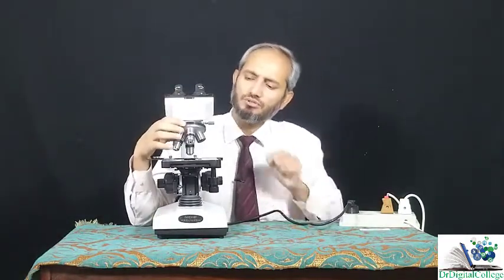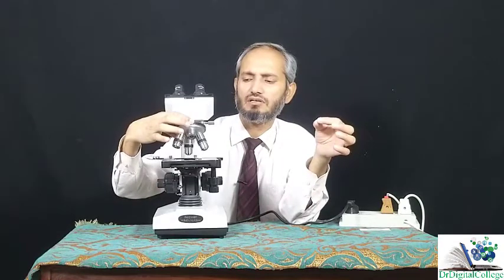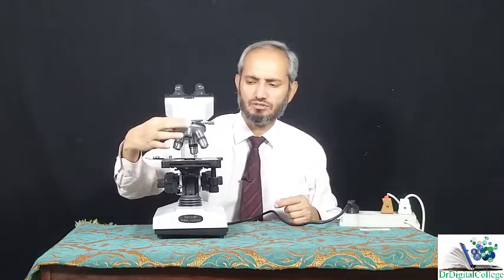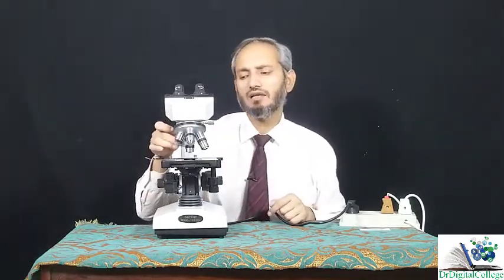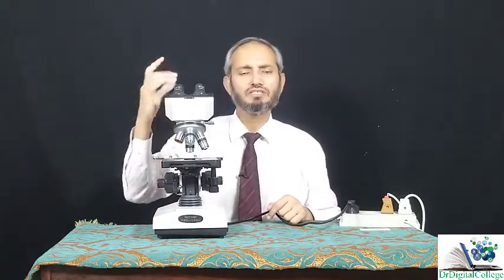Now, you should be careful while changing these objective lenses. You have to hold it from this rubber piece like this, and rotate it like this, and then there will be a click sound. Like this. This is a click sound, and then this lens is fixed at its proper place. Listen carefully. This is the click sound. Then at that time this objective lens is fixed in the direction of the eyepiece lens.